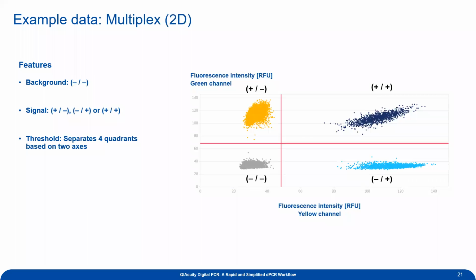Because as you saw on the plate, it has wells just like any other 96 well plate. This is your standard 96 well plate, right? So it has A through H, 1 through 12. If I wanted to do, let's say, target GAPDH in this column, and HPRT in this column, I would make up one master mix for GAPDH, pipetted across this column, and one for HPRT, pipetted across this column, and then you get the corresponding detection wherever you put your master mix.